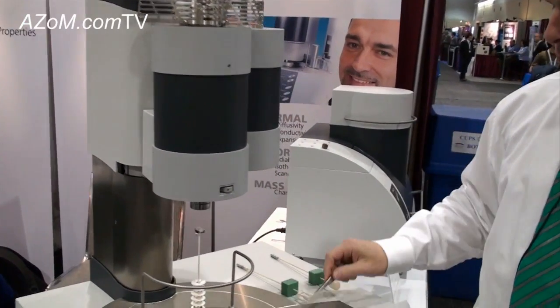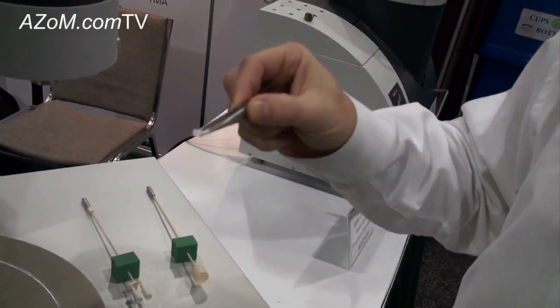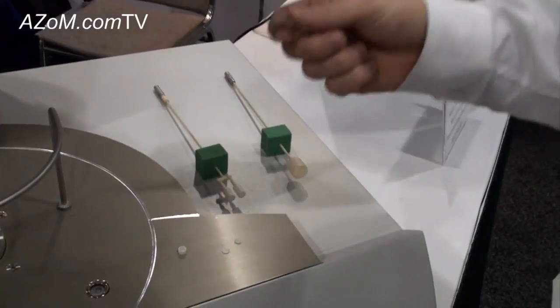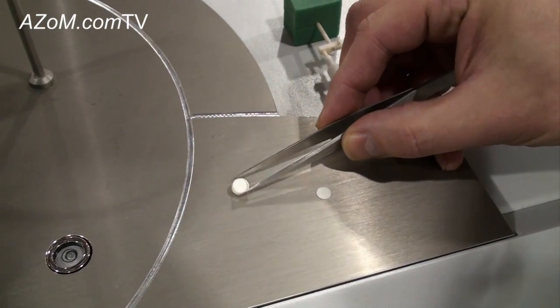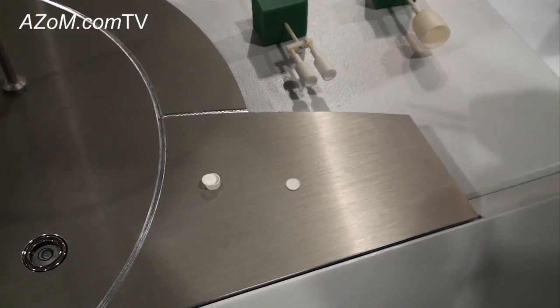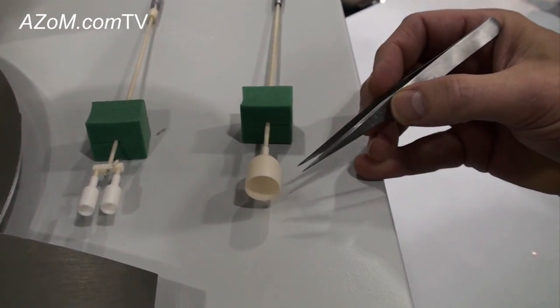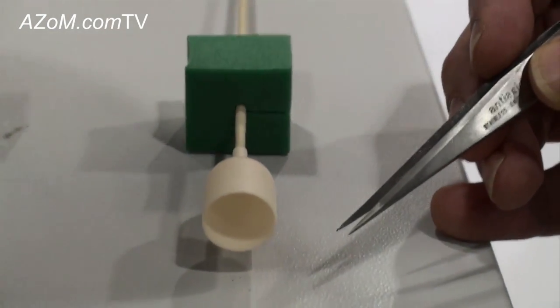Typically for DSC measurements we use crucibles of about 85 microliters in volume. They can be made of platinum, alumina, aluminum, graphite, or other materials. We often put a lid on the sample to get the best TGA or DSC data, but there is a hole in the lid to allow volatiles to escape. Alternatively, we can use a large-volume TGA-only crucible, allowing measurements on samples with volumes up to 5 milliliters.